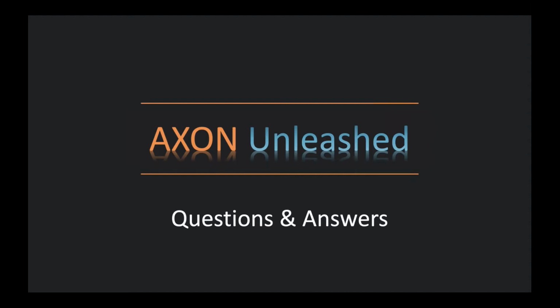Let me take a look at the questions we've got set up here. And Jen, I think this first one is probably best suited for you. What happens if I want to move to a different location while AXON is running?